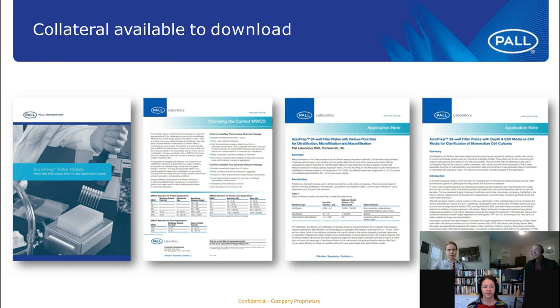If I may add, Laima, using sealing film to seal off wells that aren't in use would be especially important when you use the filter plates on a vacuum manifold or positive pressure manifold with a microfiltration application, because if you don't have liquid in those wells, they will suck false air and affect the performance of the wells that you're trying to use. Yeah. All right, thank you.